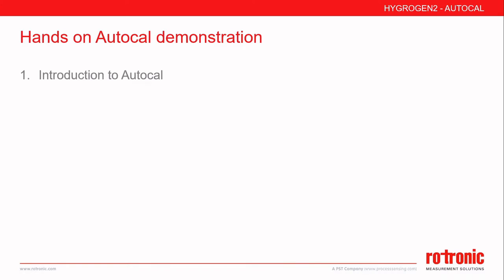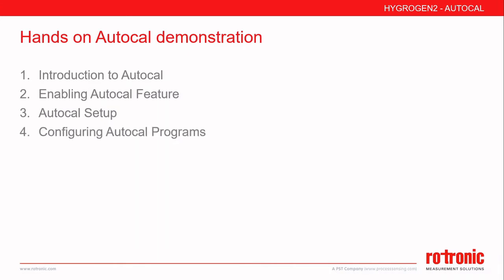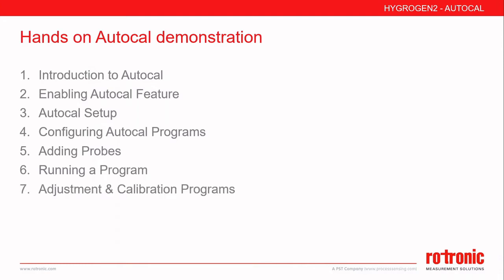We will introduce AutoCal and its basic functions. We will demonstrate how to enable AutoCal on your Hygogen, go through the basic AutoCal setup, and take an initial look at configuring AutoCal programs. We will show how to add probes, run an AutoCal program, review data during a program, detail options for adjustment and calibration of probes, and finally review our certificates and cover any additional points.